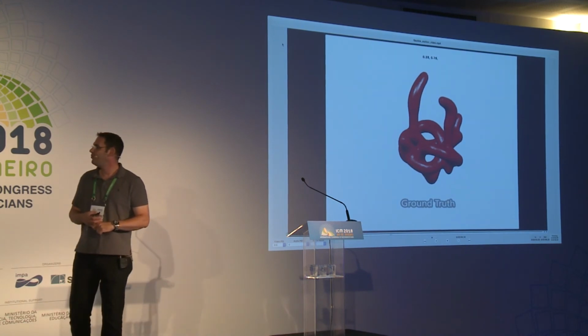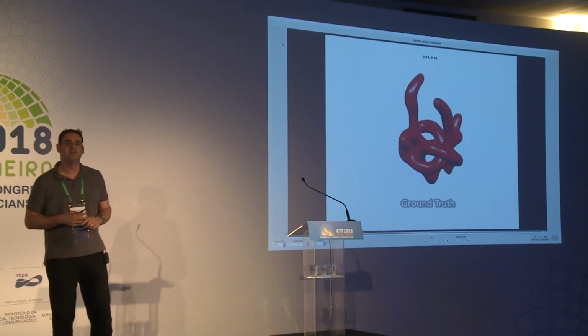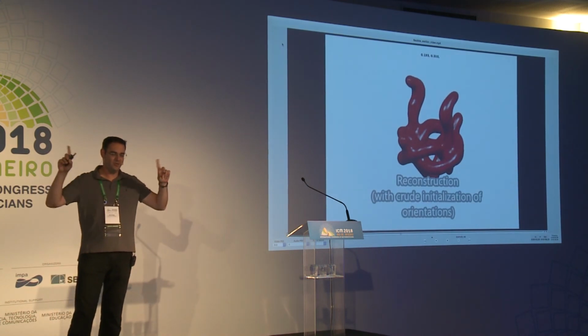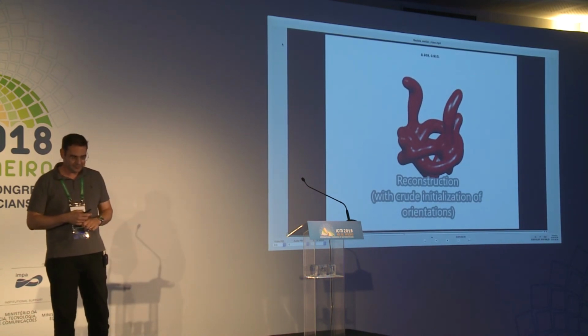Okay, this is what we call the pretzel. So we have one rigid static part, the base of the molecule, and two parts that are moving, and this is the reconstruction.